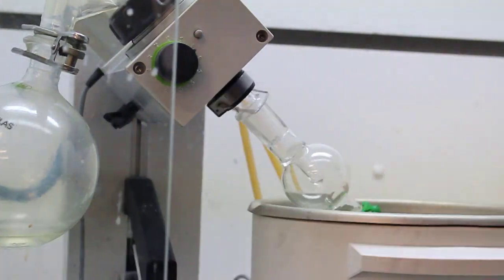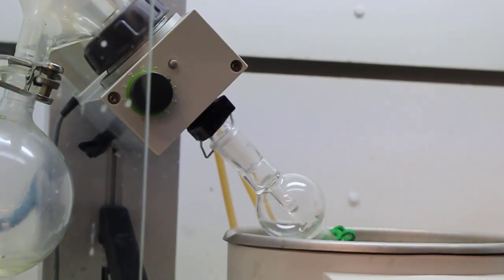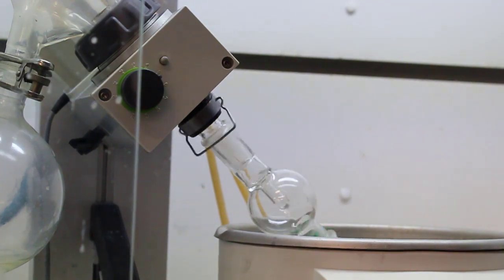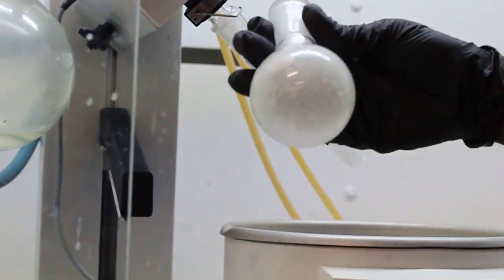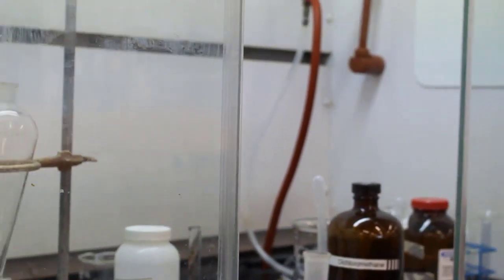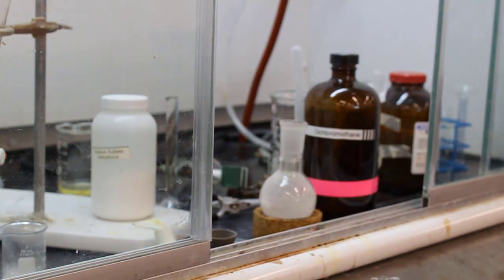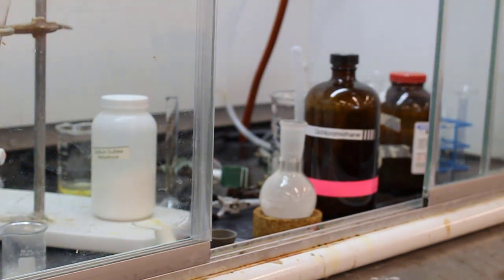Now they're going to remove the remaining DCM solvent using the rotovap. You'll see a nice fine powder on the inside wall of the round bottom flask. They're going to try and scrape some of this solid off the inside walls.